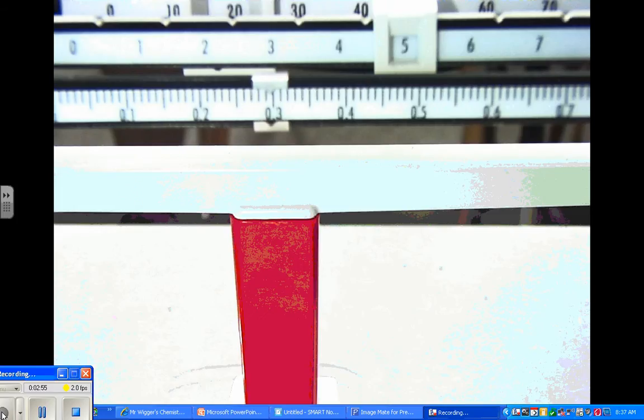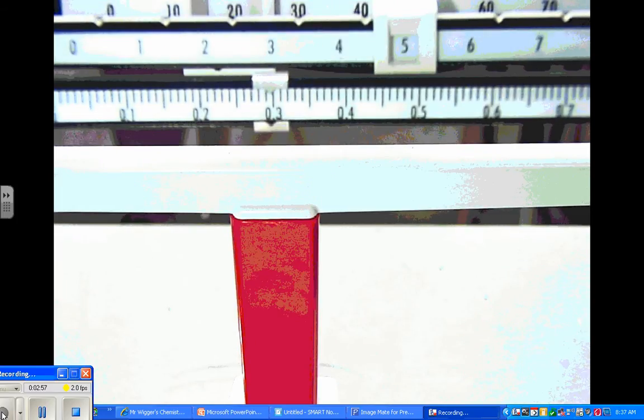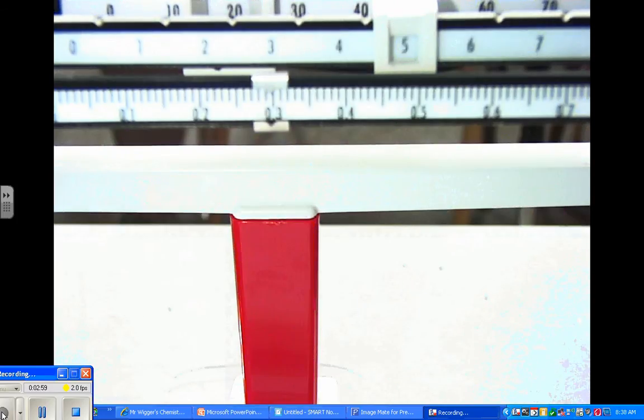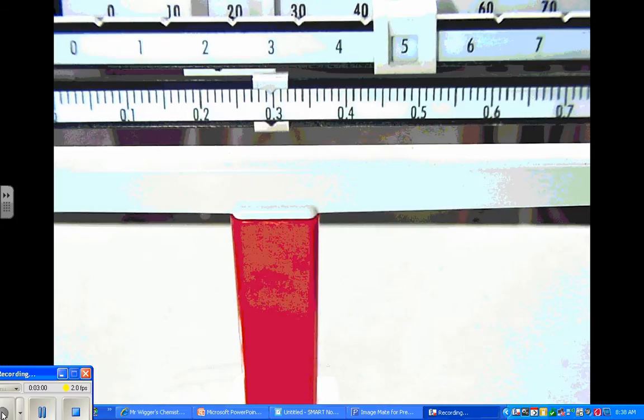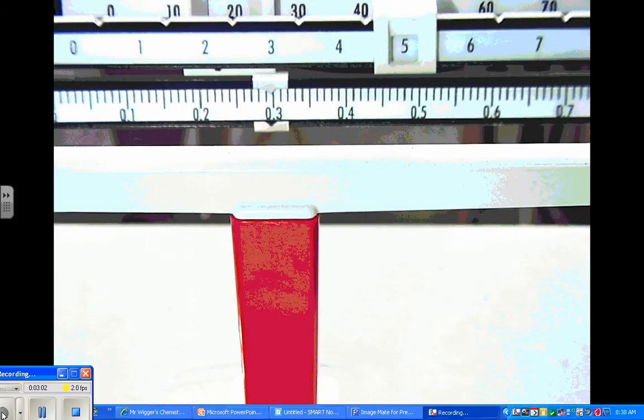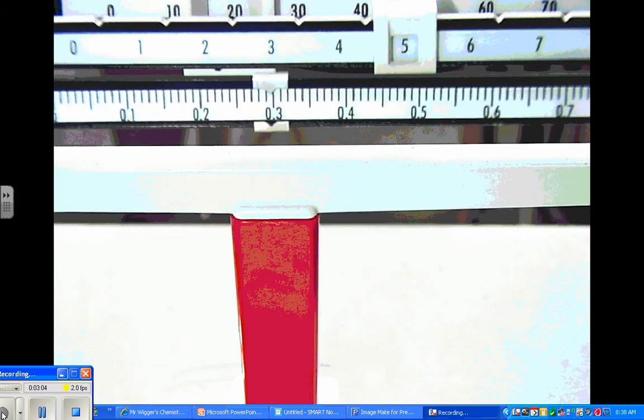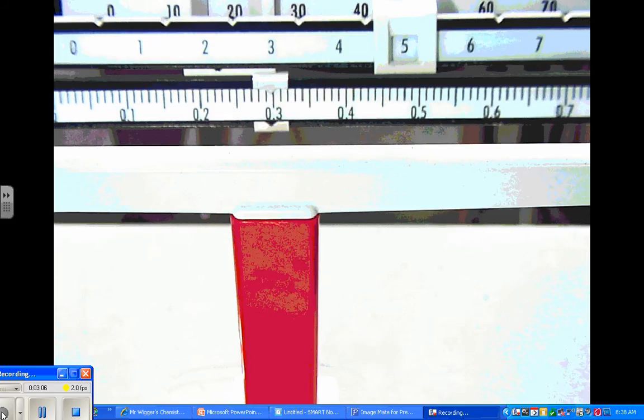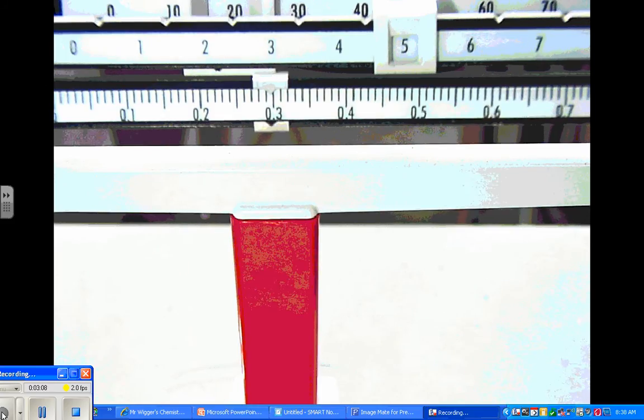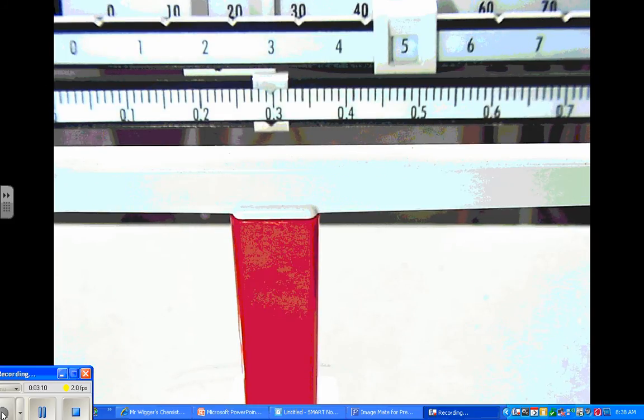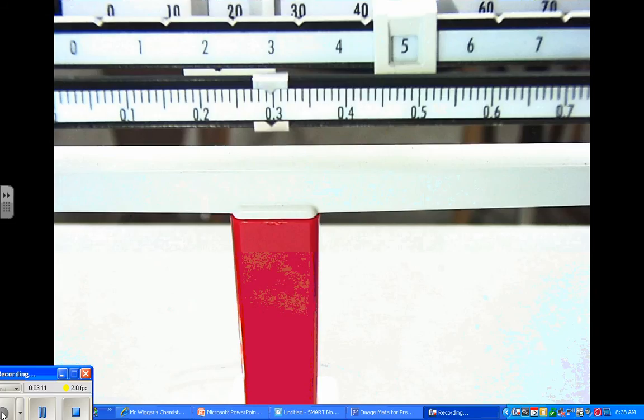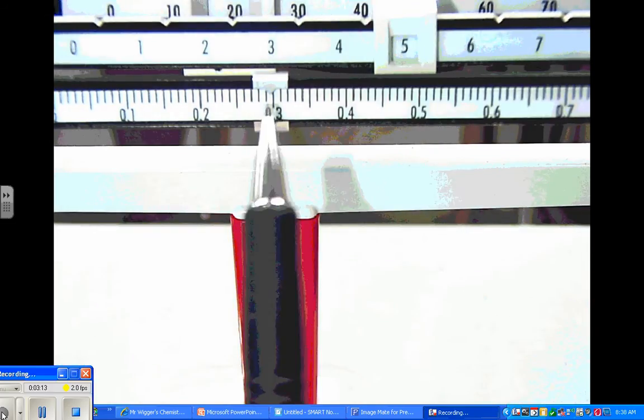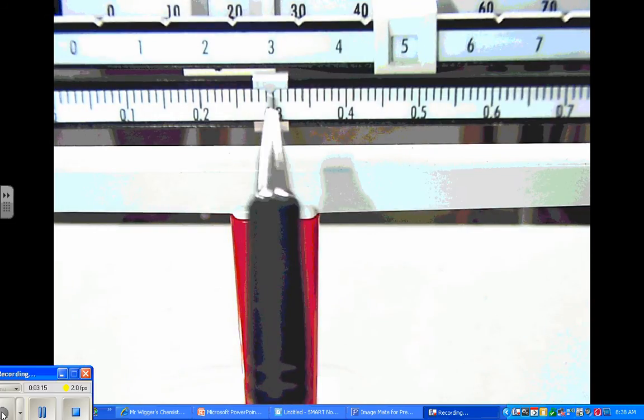And now let's zoom in on this guy and see exactly where it is. Oh, that's so nice and clear. It was. Let's try again. There. That is. That's very, very nice.